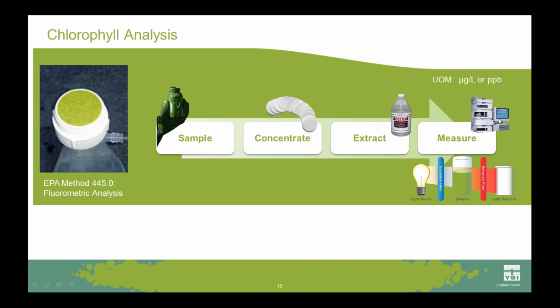Now, this is one of the most deeply entrenched methods, particularly in the research and regulatory communities. And as we're going to see later, it really does influence how people feel about sensor technologies. For now, I'm just going to say that as scientists, we should all appreciate the role that sample prep plays, not only in this analysis, but in all analytical methods. So one should be really cautious in making comparisons between methods that don't use the same sample preparation.